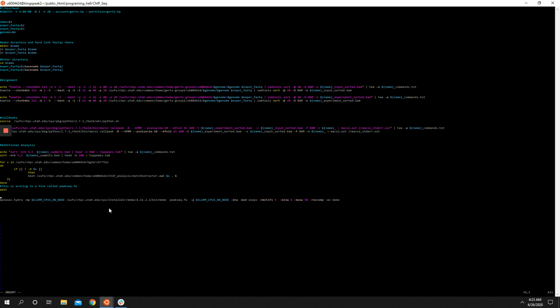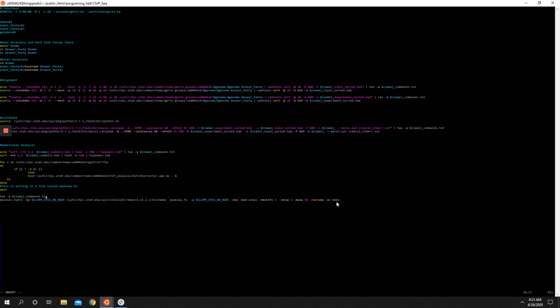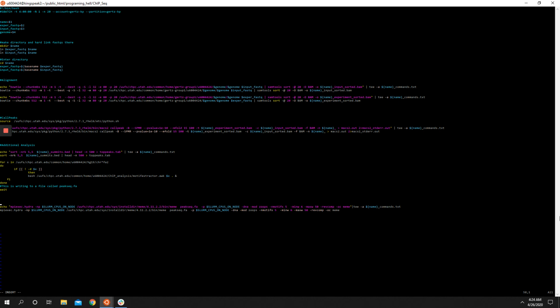And this should be the last one. We're just going to pop this guy in here. So essentially what that's going to do is that's going to write out all the commands, and then we can add our own stuff if we wanted to here to tell us what was going on, but I don't think we really need that.